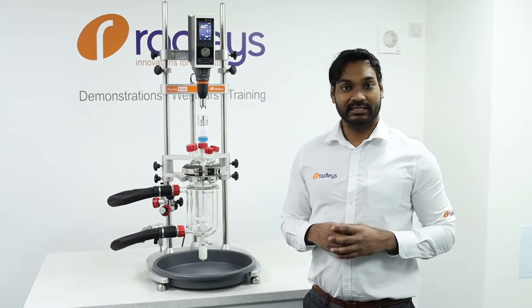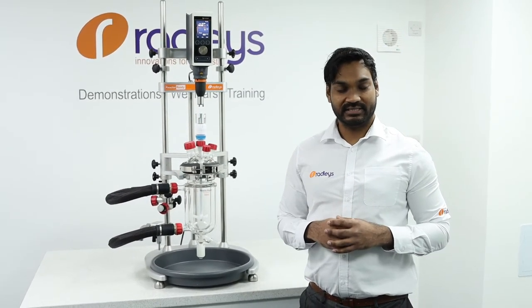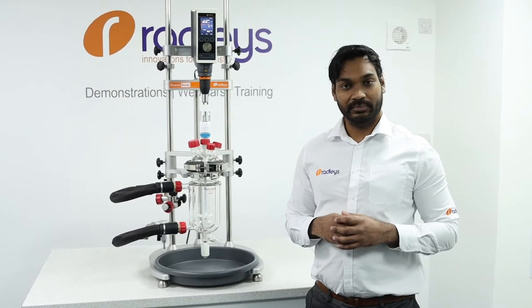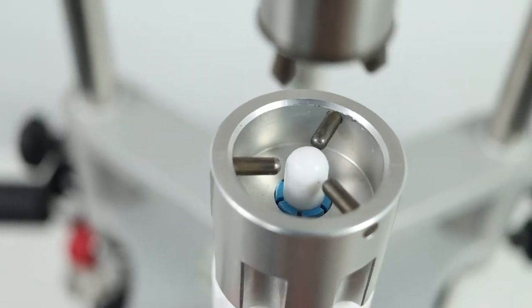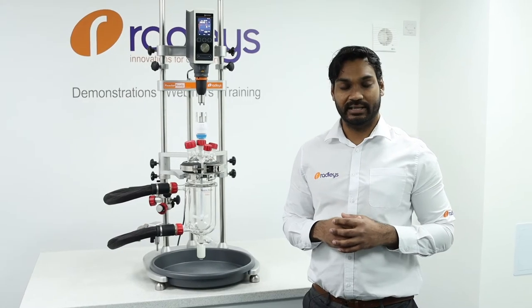With Reactor Ready the impeller doesn't connect directly into the chuck of the overhead stirrer. Instead, the drop-in coupling has three vertical pins which engage with the three horizontal pins in the stirrer guide in order to rotate the impeller.